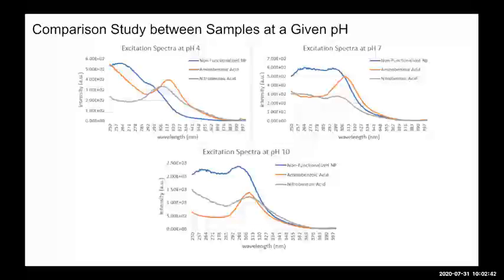So depending on that, that may change a little bit. And also these graphs were normalized. So right after just scanning them, it could be a little bit more noisy, or the profiles could look a little bit different. Oh, and I also see that the scale is different in that pH 10 plot by a factor of 10. Okay, that helps.